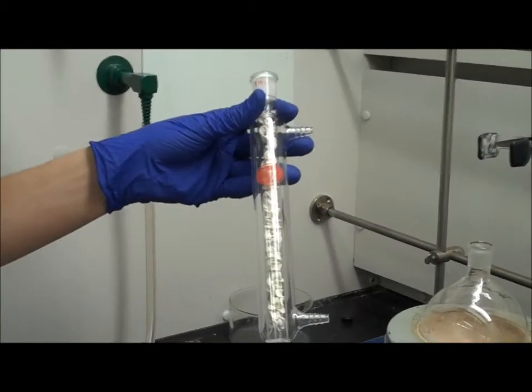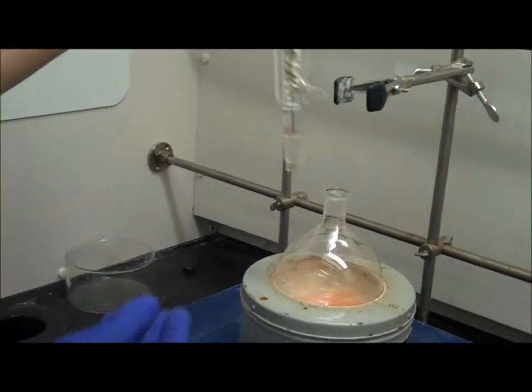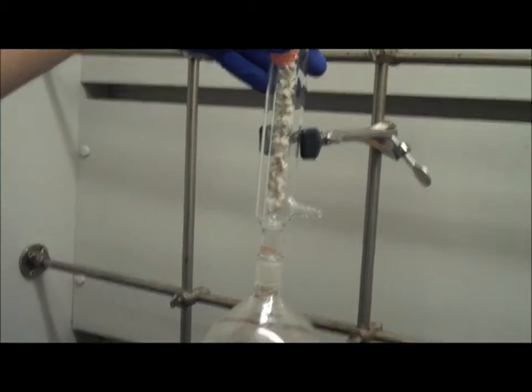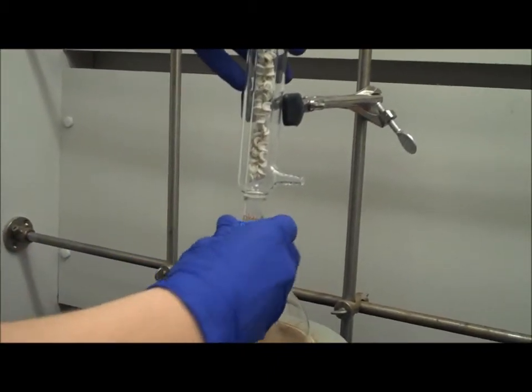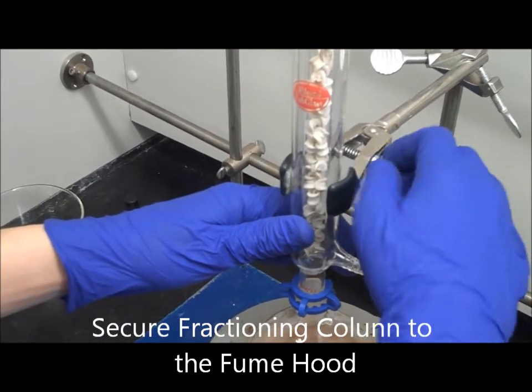After the fractioning column is filled with packing material, connect it to the round bottom flask placed in the mantle. All glasswork should be clipped together throughout the experiment to ensure no glass breakage. The fractioning column should also be clamped to the round bottom flask.